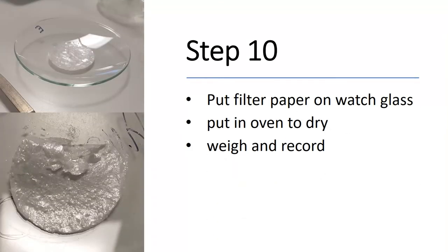Step 10. Once fully filtered, carefully pull the filter paper out of the funnel and place onto the watch glass. Place the watch glass into the oven at 80 degrees Celsius for up to 10 minutes or until completely dry. Once completely dry, weigh the crystals and record in your lab manual.